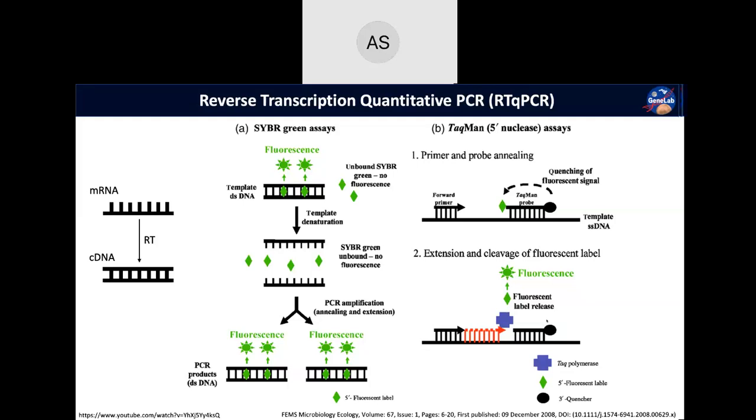What we do is we give it the same amount of starting mRNA, but initially we don't know what transcripts are in there in that mRNA. And so if, let's say, our flight sample has higher NF-kappa B, then we will have more NF-kappa B in that flight sample to start with than in that ground control sample.